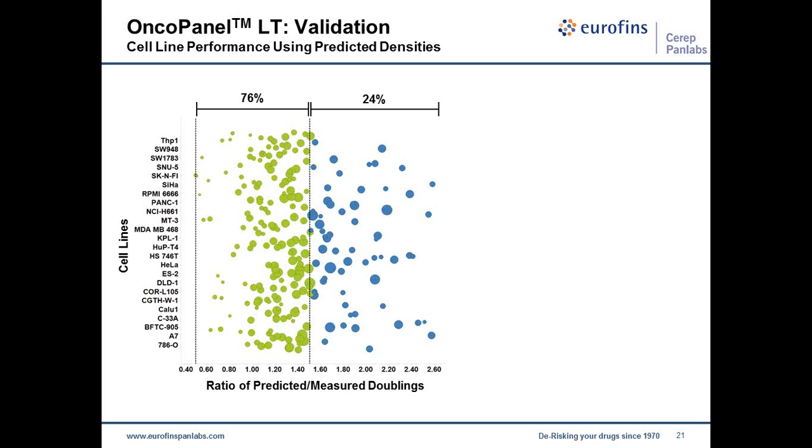In this case, over the 10-day incubation with our current protocol, we would accurately predict the doublings in about 3/4 of the cases. This meant that 76% of the 240 cell lines grew logarithmically because the doublings were predictable. In contrast, about 24% of the cell lines grew a little slower than predicted.